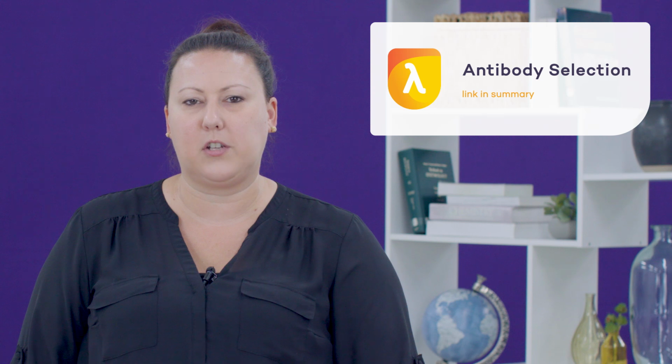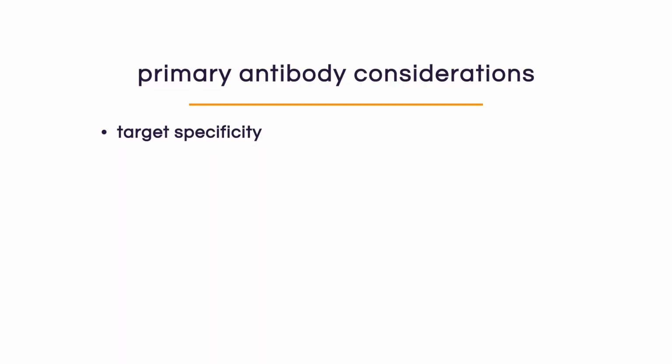The choice of primary antibody for your Western blot will depend on the antigen you want to detect and the antibodies that are available that recognize and bind that antigen. There are several important selection criteria that should be considered for primary antibody selection. We will briefly review them here, but for more information, please refer to the Lambda U course on antibody selection. One of the first considerations you want to make for primary antibody selection is to find an antibody that is specific for your target protein.